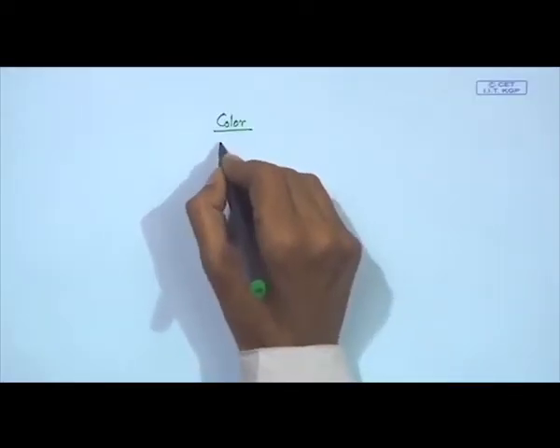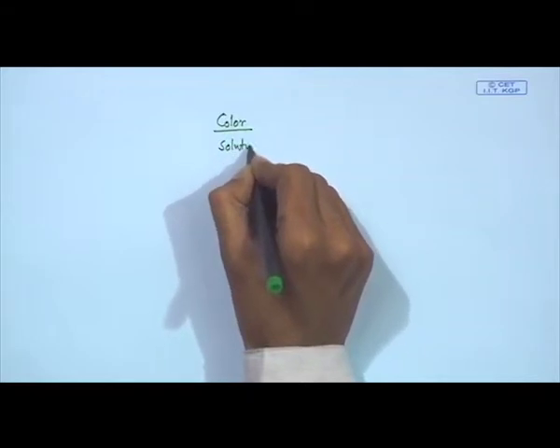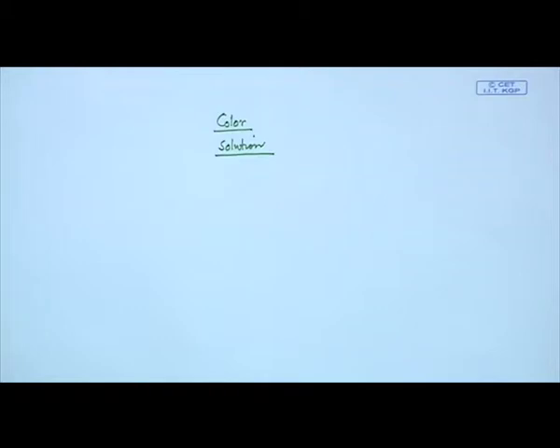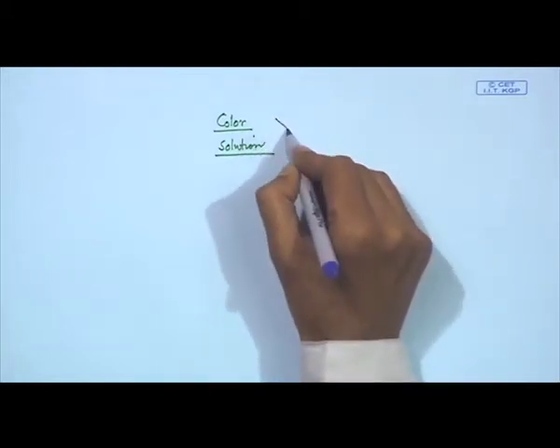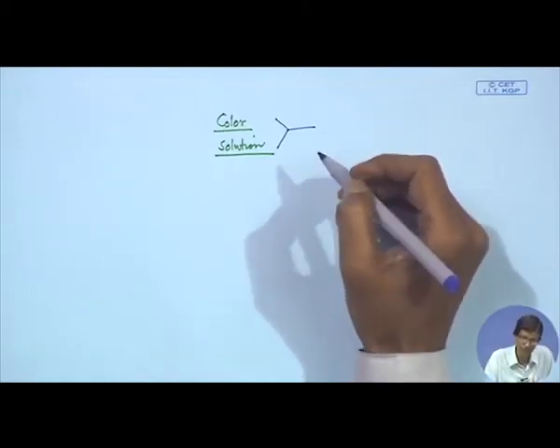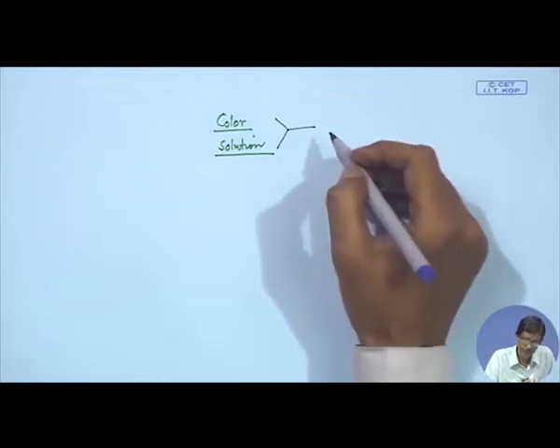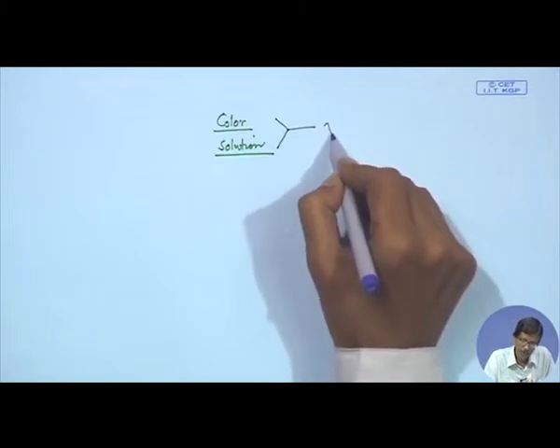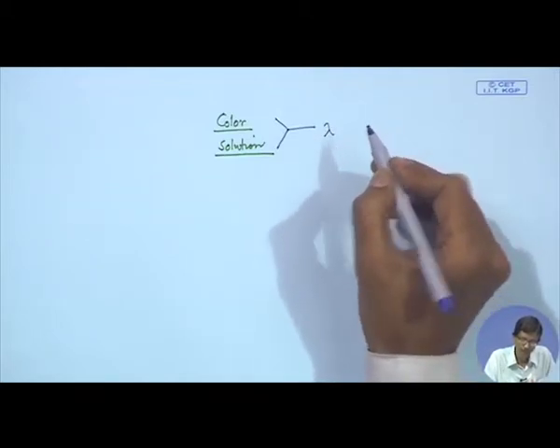Hello and welcome to this class, where we are introducing the measurement of color. If we have a colored solution, or you have to do something to get a colored solution, then we can monitor the color. For a simple acid base titration, as we discussed in our previous class, if you have a colored solution, how can we detect the corresponding change in color?